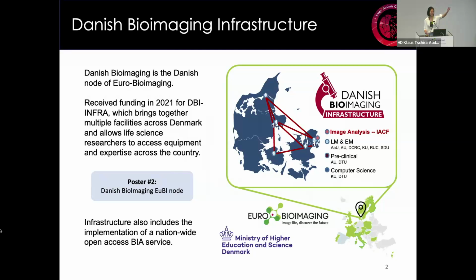Social media, run by Sonia at the back over there taking pictures. And a course catalog, with even a cross-institutional course, so the students go around the different institutes and take a course together. The infrastructure also coordinates investments to implement new bioimaging technologies. I'm not going to get too deep into all of this. If you want to know more, talk to Thomas or Nuno. They have a poster that will let you know more about this.